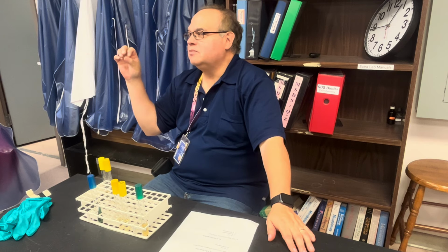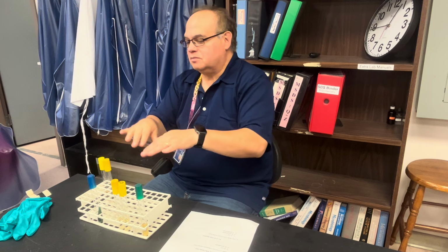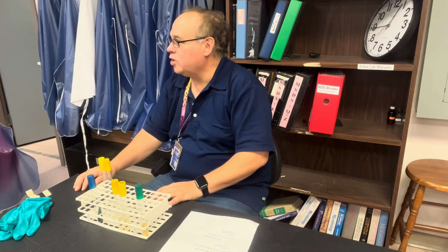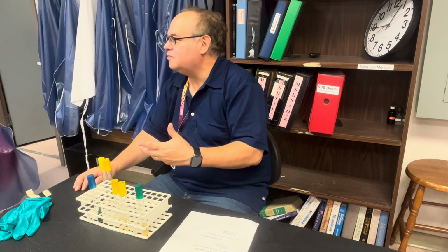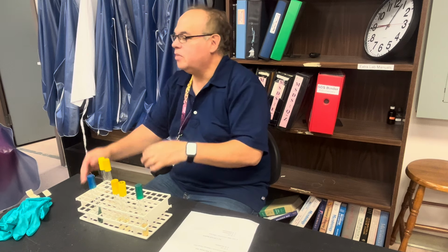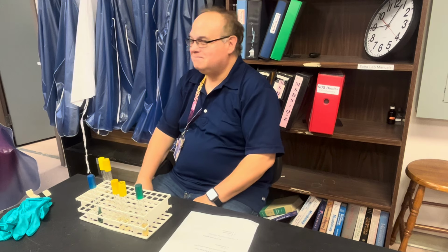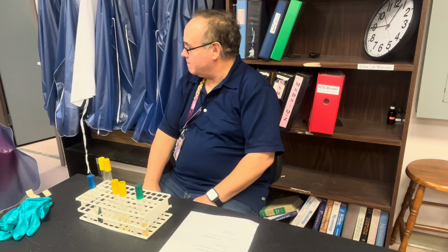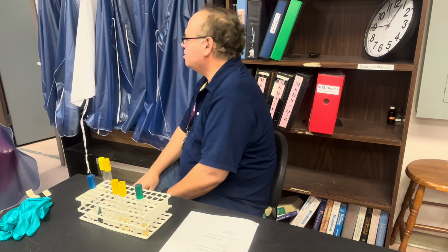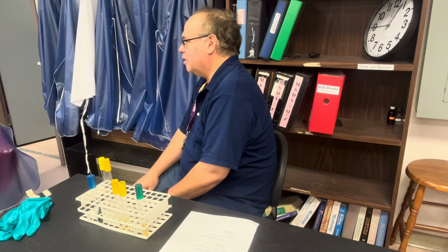We have one organism that produces slightly basic conditions, and the tests aren't sensitive enough to discern it. It's going to come up positive for both of them. So when you're doing an unknown and you see that they're both positive, first of all, think it's probably an error, but then look at the other results and see if it matches up. Because on the table you'll see 2 positives. So if it's any other organism, it's user error. Usually they contaminate with some other organism.